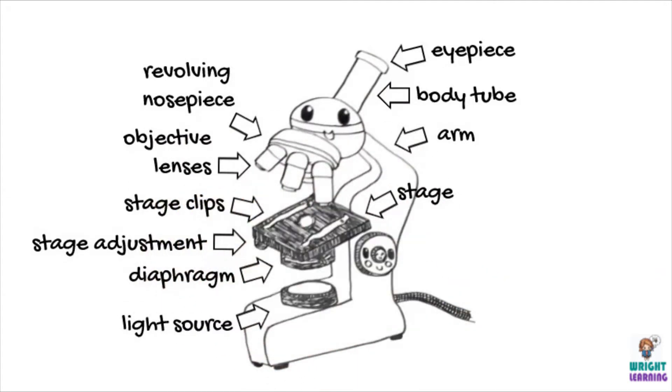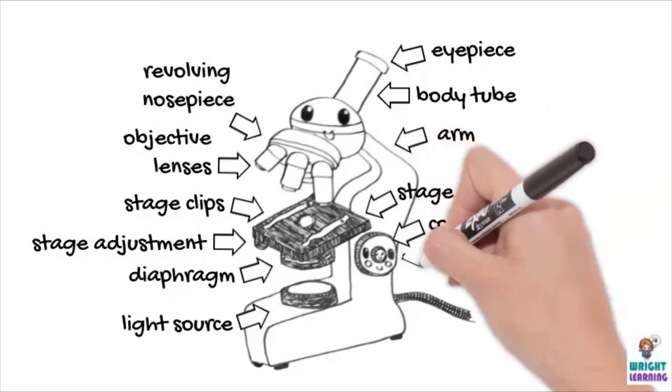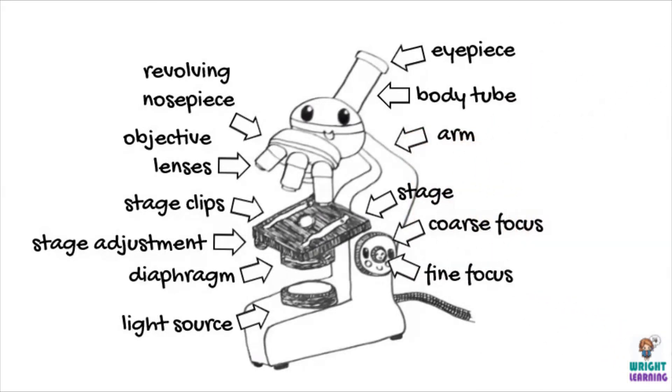The dials used to focus the microscope may be arranged together or separately. These are called the coarse and the fine focus, which I'll explain more about later on in this video. We also need a power source to power our light, so remember to plug in your light microscope.